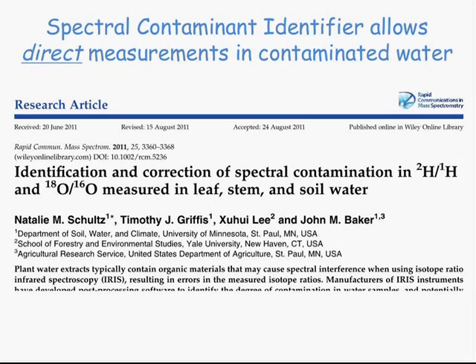If you're going to change the water, then the nebulizer inside the WVISS would need time to equilibrate with the new water. So that takes several minutes. If the question is just switching between vapor sources, that happens much faster. Okay.